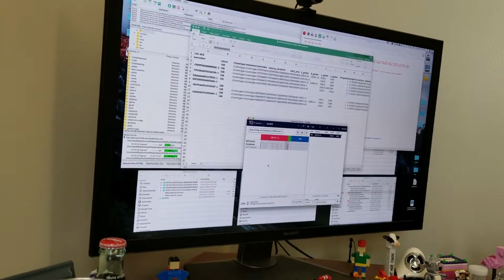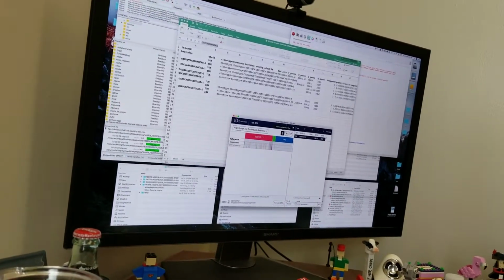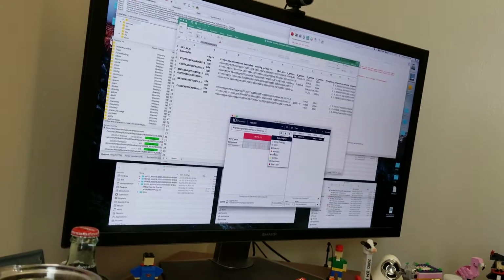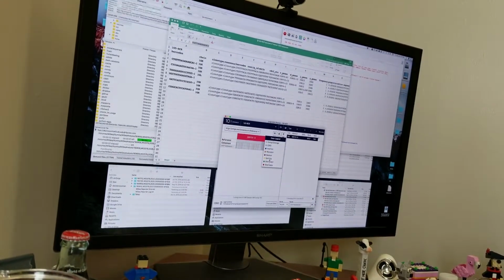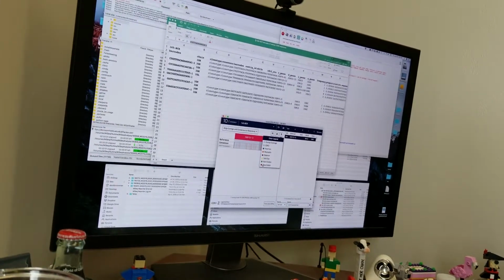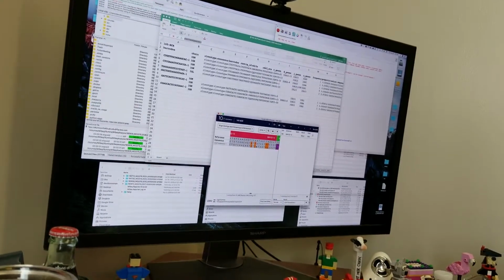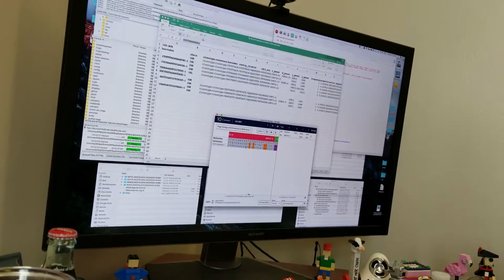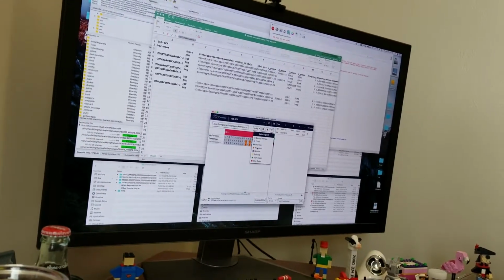Now, what are those bars? These are like mutations. They are indicative of a mismatch. Green is your start codon, orange is mismatch. I've seen some purple deletions. The red should be a stop codon, and so forth. And if you click on these, you can zoom in to the actual sequence, and then you can come back to the color scale again and see, well, the orange is a mismatch.